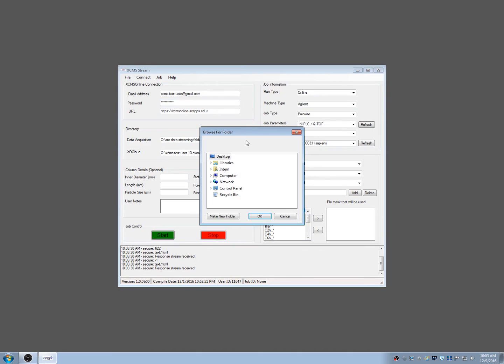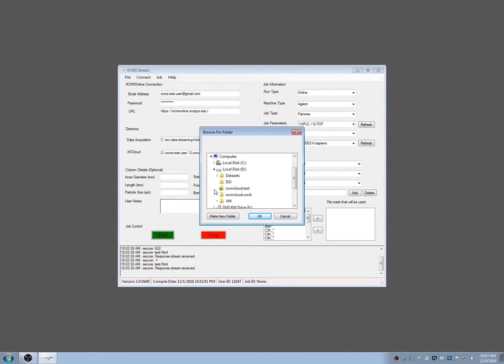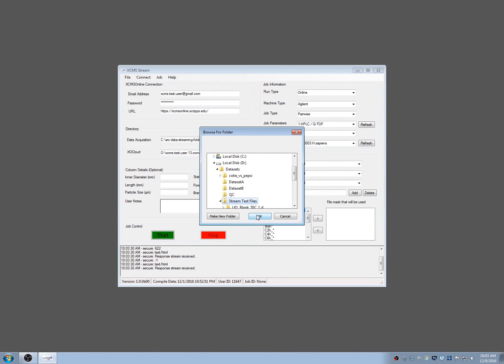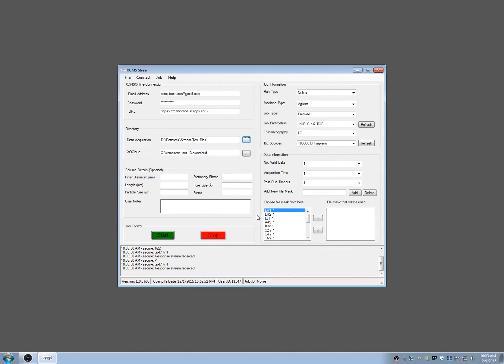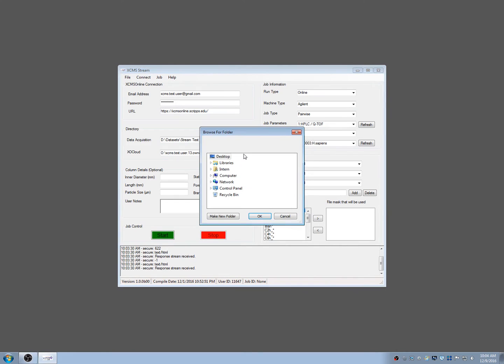Next, choose the data acquisition directory. This is the folder where data files are or will be located. As your experiment runs, XCMS Stream will compress the data and stream it to the XOCloud working directory before submitting it to XCMS Online. The location of both directories must be entered in XCMS Stream so the software can handle the data files correctly.